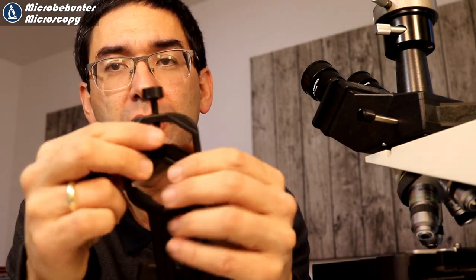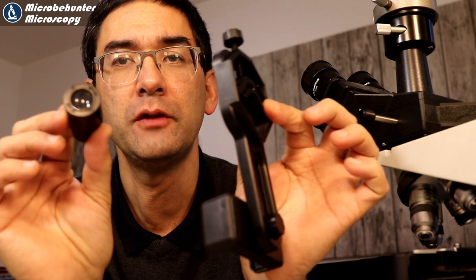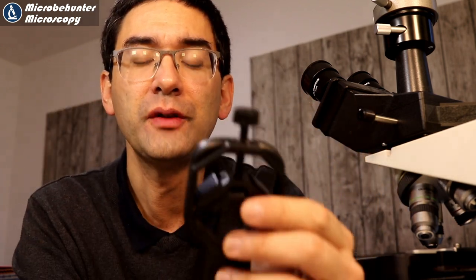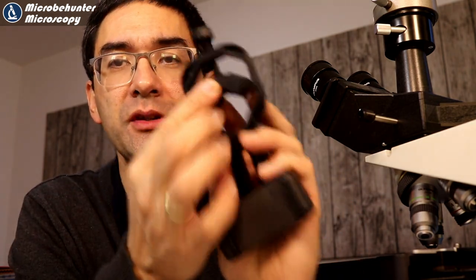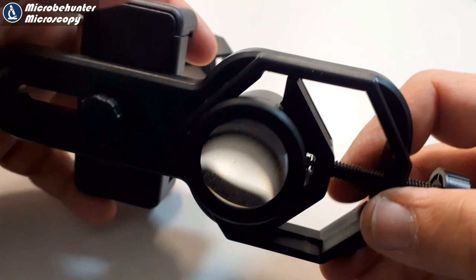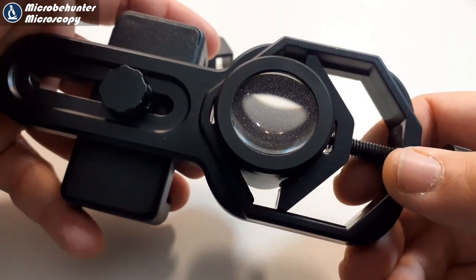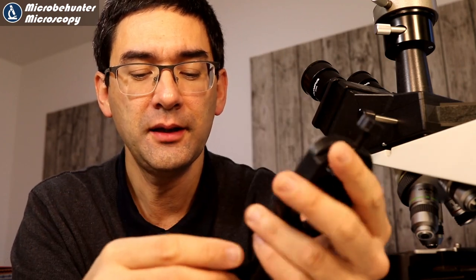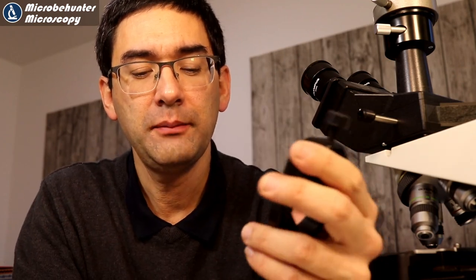This one here is a little bit more flexible concerning the size of the eyepiece, because as you can see it's able to accept a large range - even very small ones and also very large ones. So take this into consideration. In that sense I would say this one is a little bit more flexible concerning eyepiece size, and you're also able to fit in eyepieces for stereo microscopes.